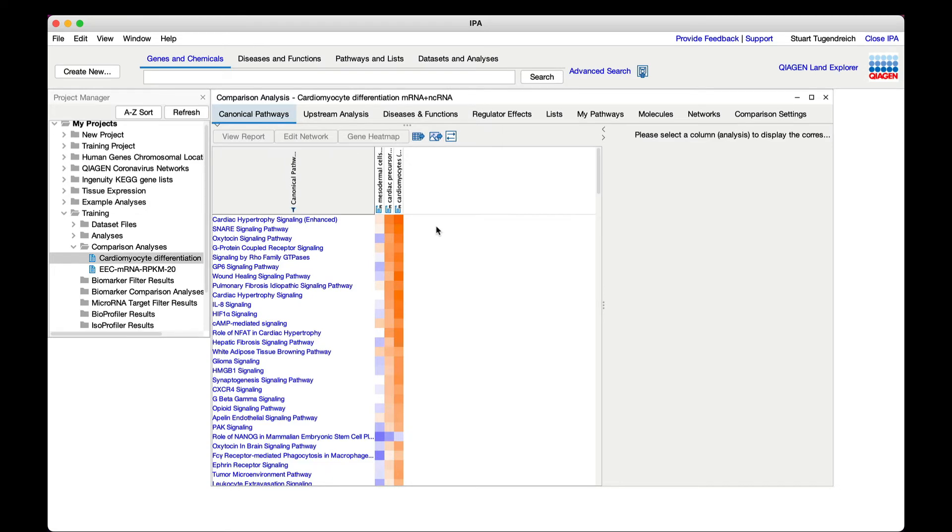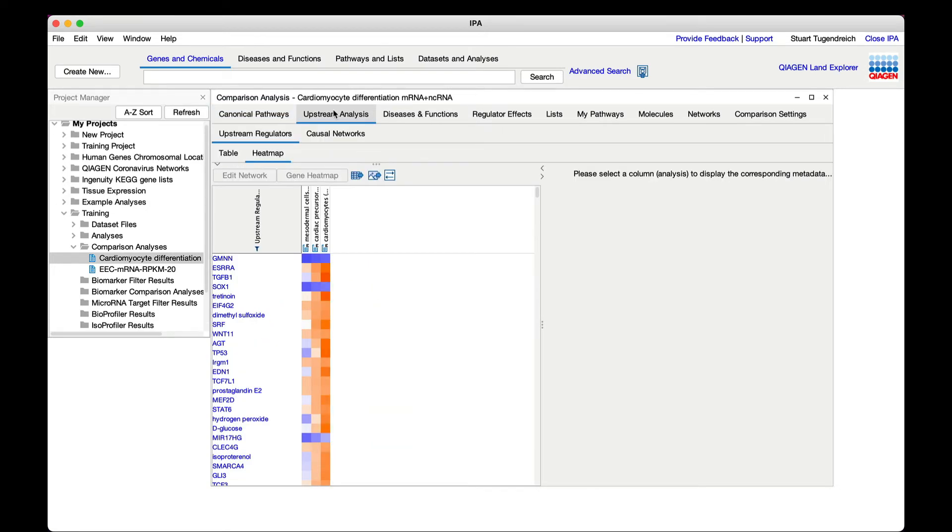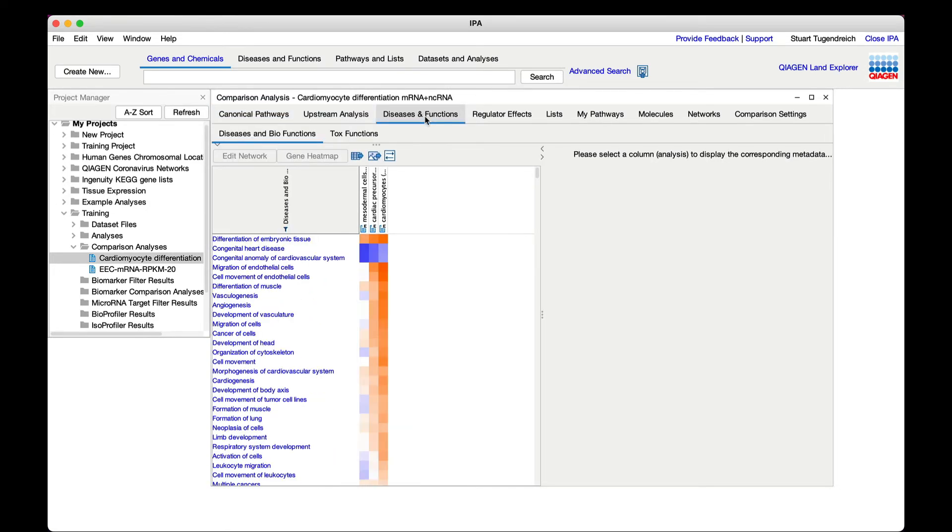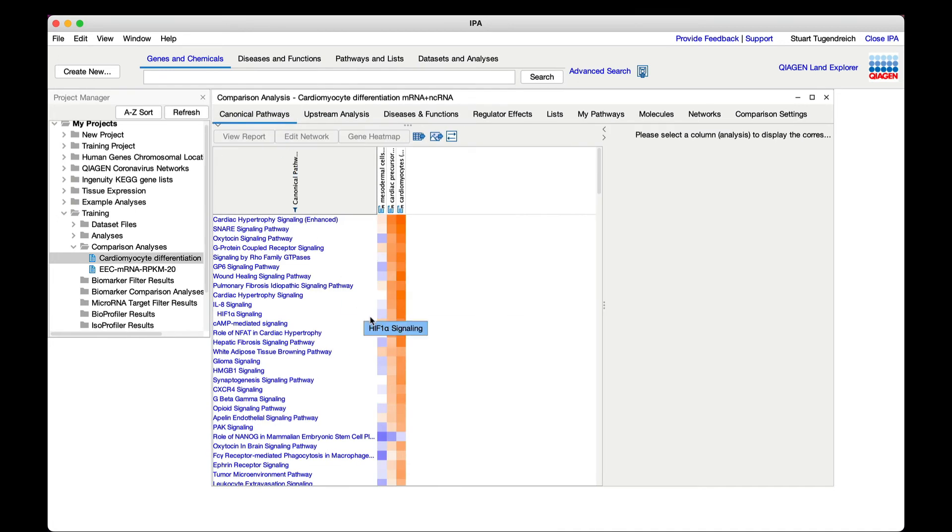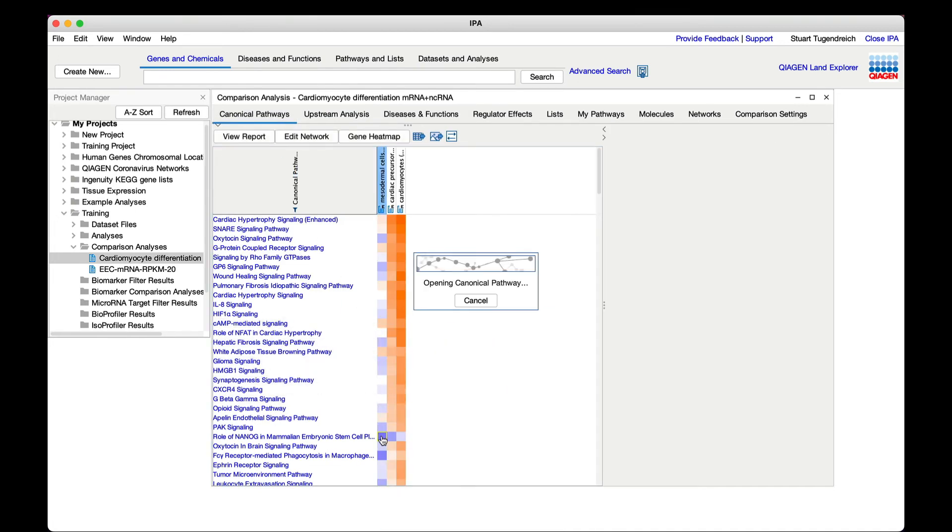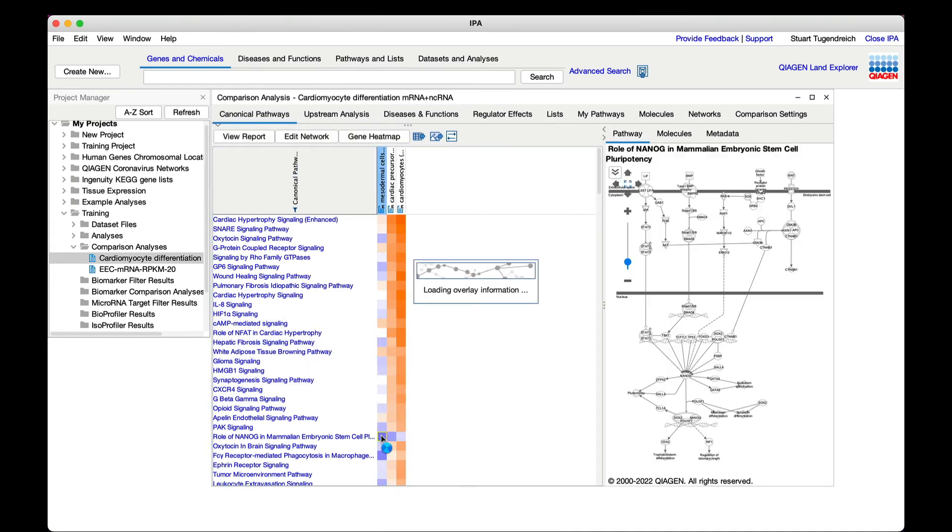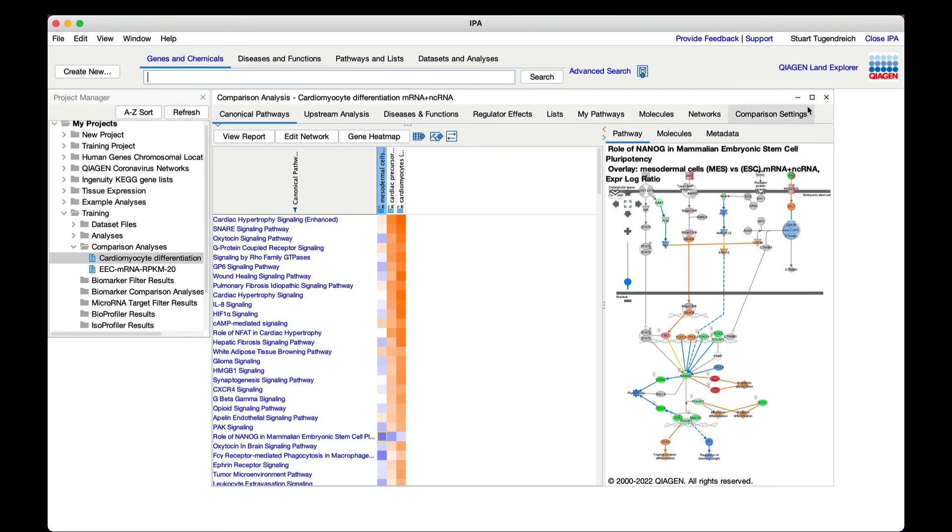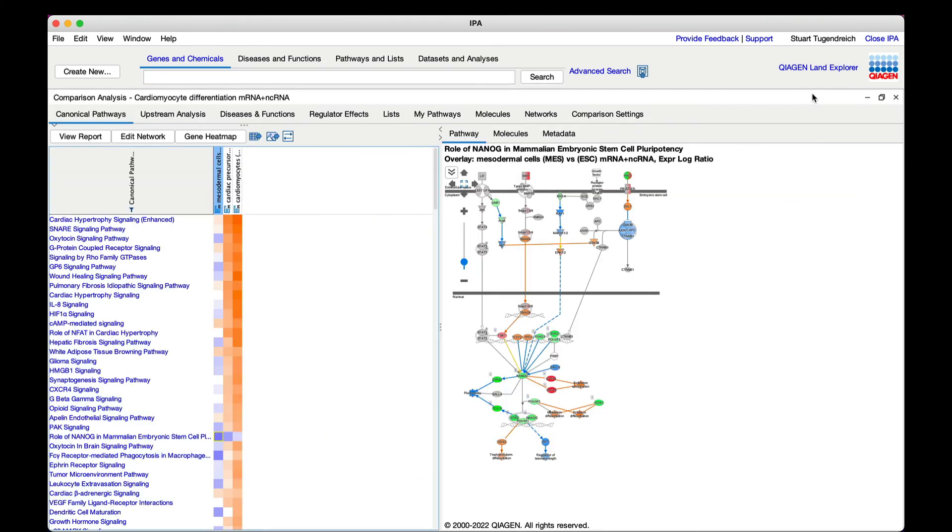There are separate tabs for canonical pathways, upstream analysis, and for disease and functions. You can click on a square in the heat map to visualize that entity overlaid with the data set.